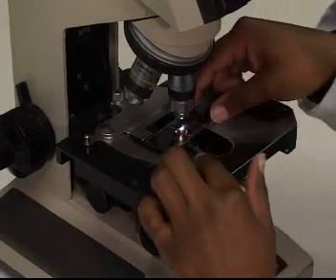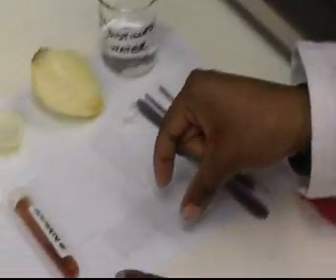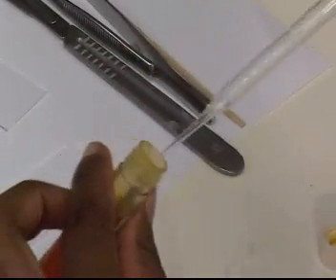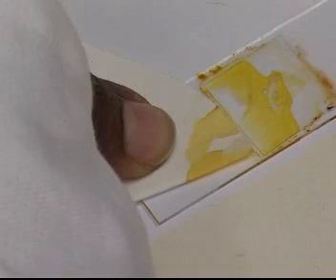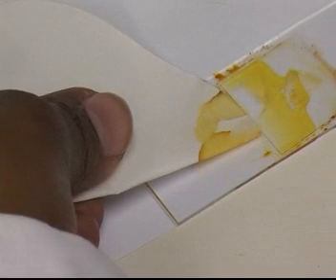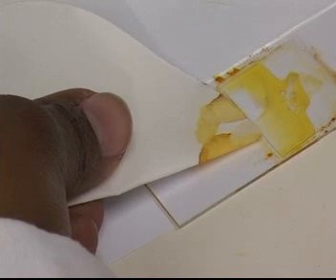A number of dyes are used to stain the structure of cells, but for the purpose of showing plant cells, we will use iodine. To stain the slide, you need to remove it from the stage and place a drop of iodine solution at one end of the cover slip. Now, keep a piece of absorbent paper at the opposite end to draw the stain across the slide. Then, after about 5 minutes, the cells will become stained and easier to see.